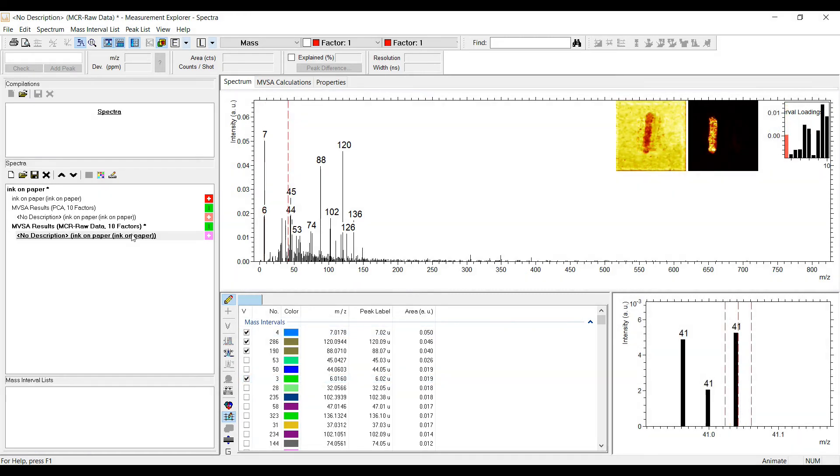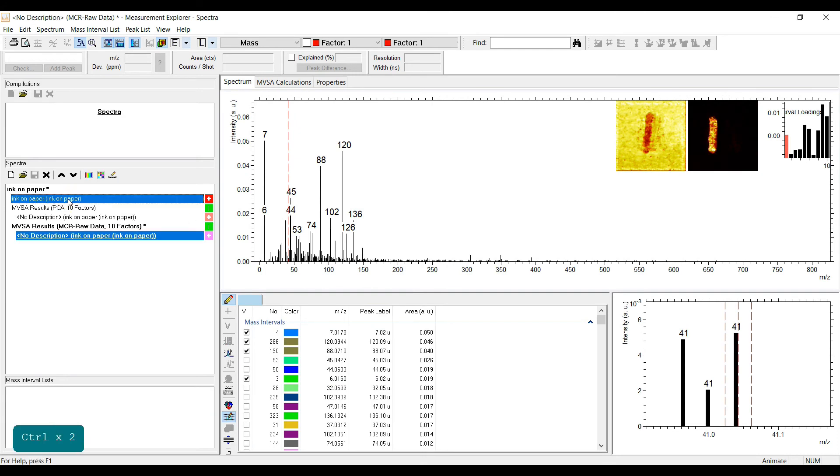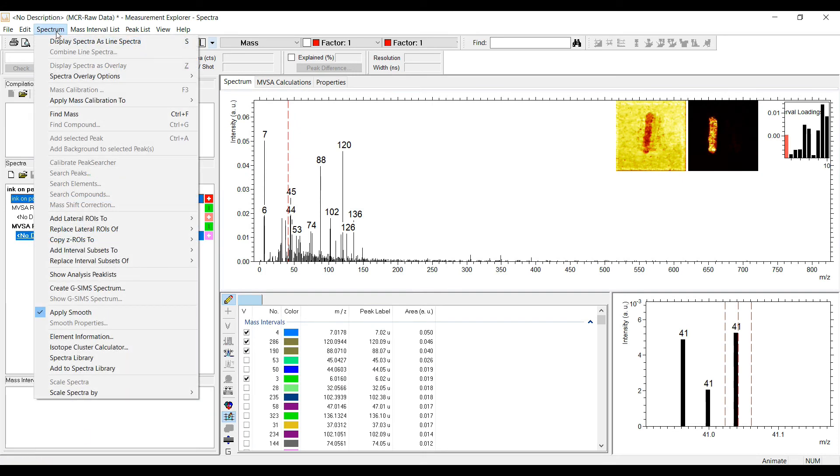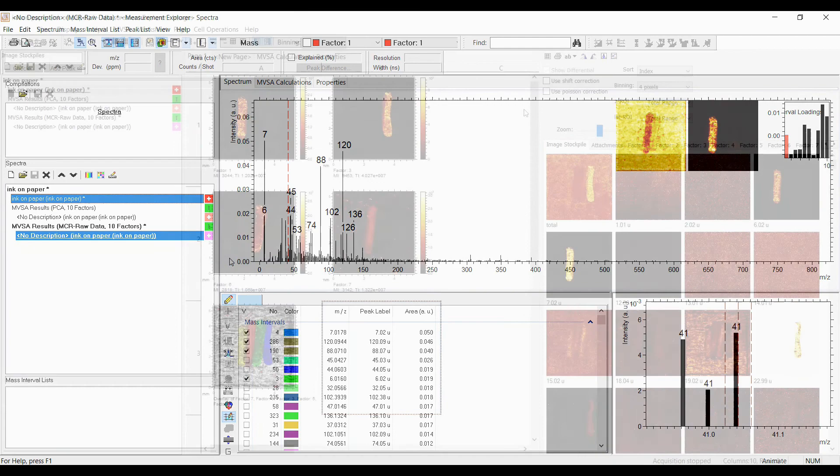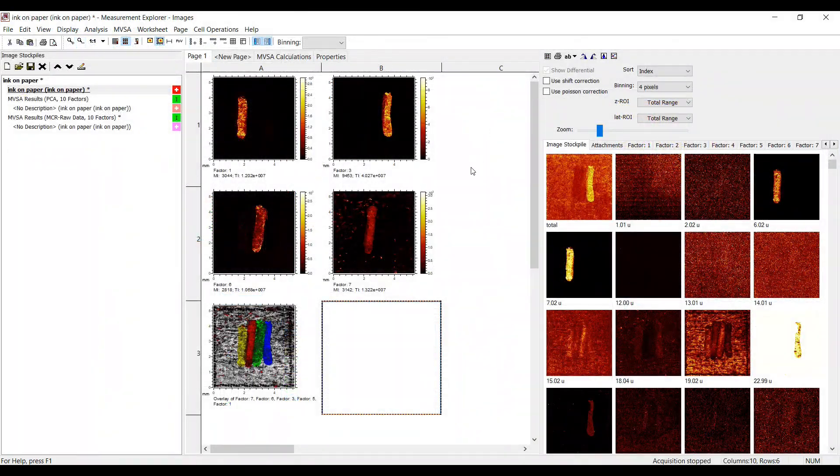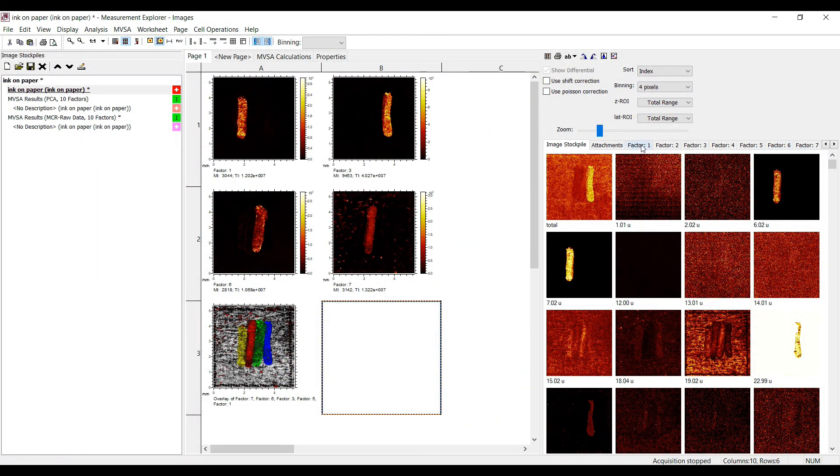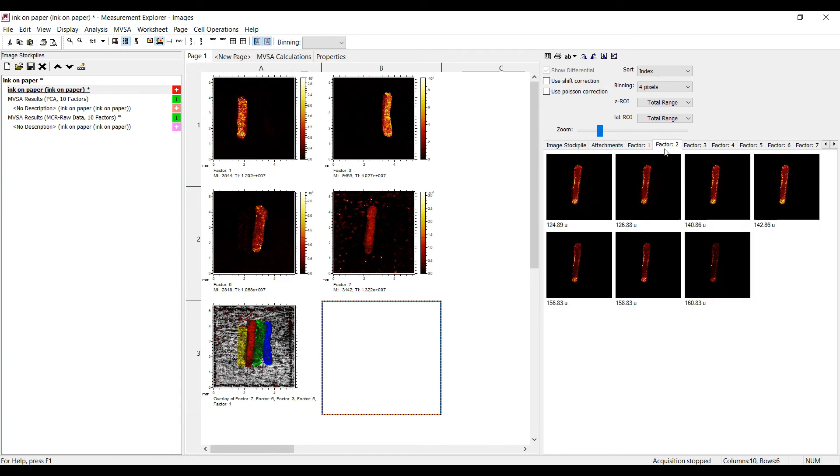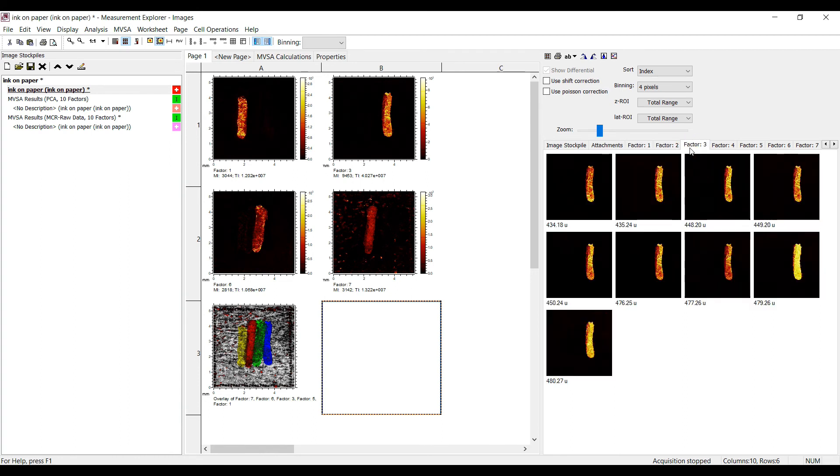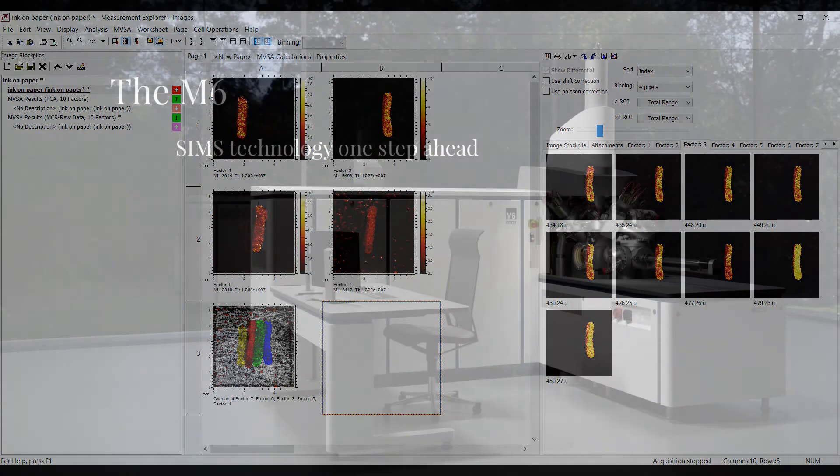The interval subsets are then applied to the original data view. In the image program, each mass interval subset is displayed as individual tab in the image stockpile. In the end, with a combination of MCR and mass interval subsets, I was able to find mass intervals representing the different inks very quickly.